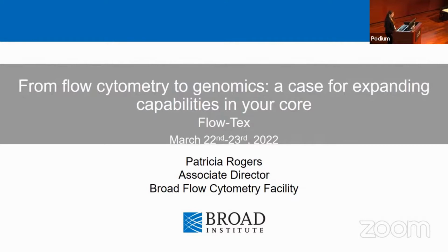What I'm going to talk about today is how you take your flow cytometry lab and move towards genomics. A lot of us are interested in doing this because it's a very popular assay, obviously. We're all doing single cell genomics in our labs now. I'm just going to show you how I did it, and maybe you can have some takeaways so you can do this in your own course.